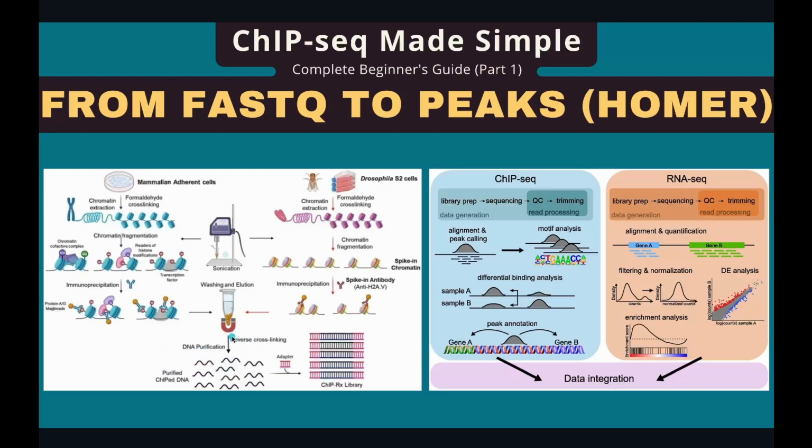then subjected to sequencing. The data analysis process for ChIP-seq is not much different from the ones for RNA-seq. Basically, it's adapter trimming, aligning, and quantification, except we call the enriched regions peaks instead of genes, signals instead of counts.